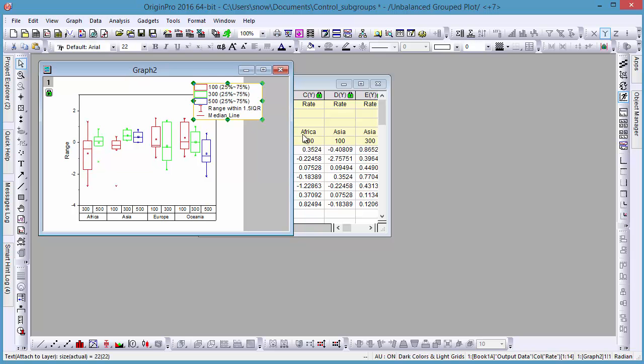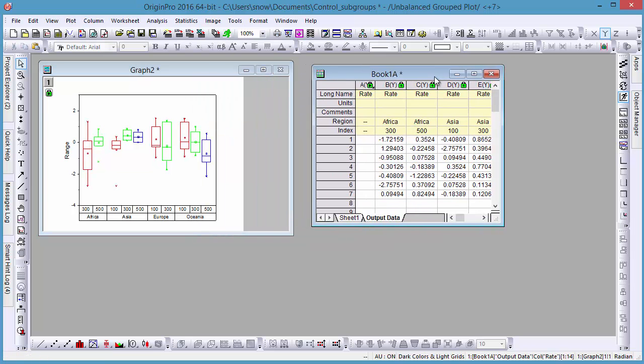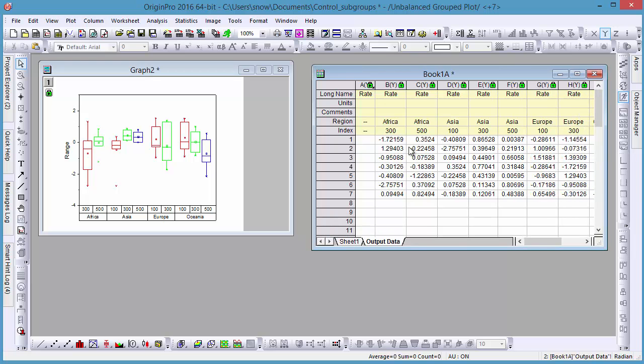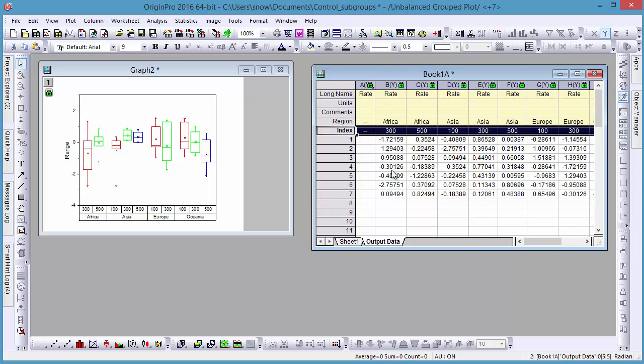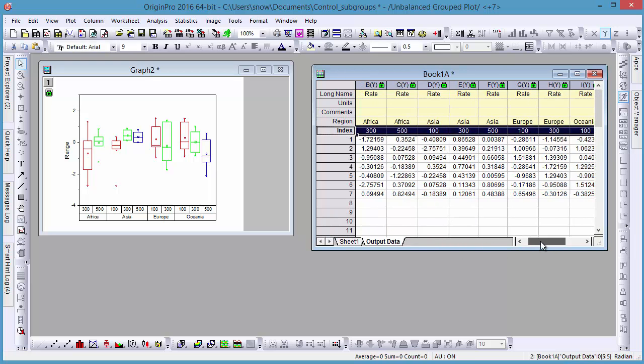After plotting, an output sheet is created with transformed data for this chart. Here, you can see region and index column label rows.